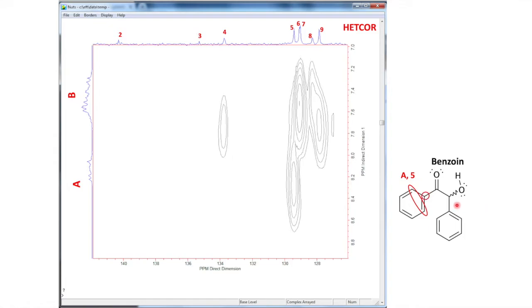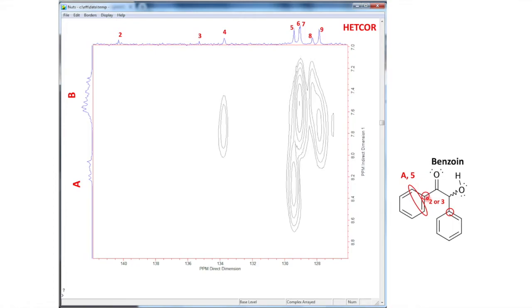What about our two carbons in the aromatic region that have no hydrogens? Remember the trend: carbons without a hydrogen tend to give shorter signals. Carbon signals two, three, and eight are all pretty short; four, five, six, seven, nine are taller. Carbon three has no hydrogens associated with it in the HETCOR, and carbon two has no hydrogens either. So those are either carbon signal two or three. I won't be able to assign all of these absolutely, but I'll get a few — and I'll be giving you this spectrum in your report worksheet.